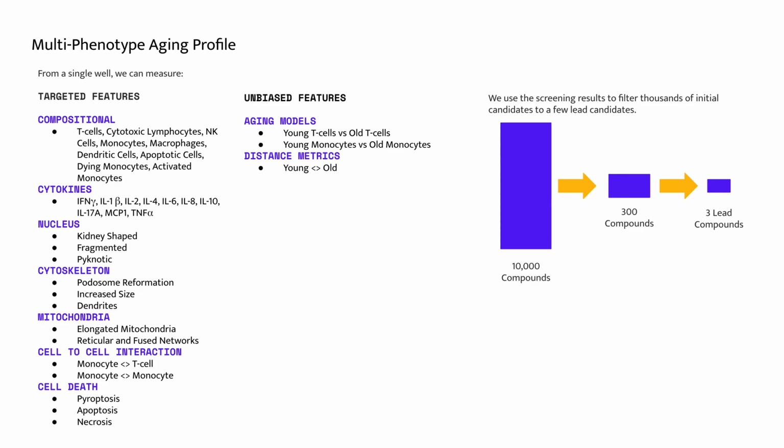Since the aging profile can be derived from a single well, we used it to screen thousands of compounds to find the ones which make an old profile look like a young profile.